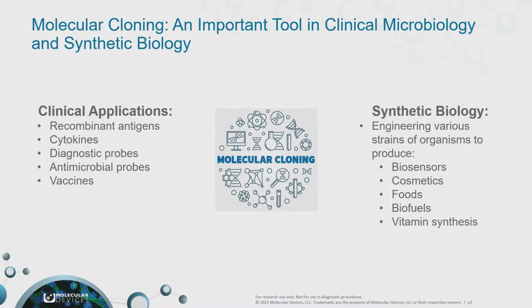While the molecular cloning process has not changed since its discovery over 50 years ago, the demand for molecular cloning has quickly risen to the spotlight as we identify new pathways and druggable targets with clinical implications to treat many diseases using recombinant proteins, and the development of diagnostic probes to detect infectious diseases such as COVID-19 or to develop vaccines against them.